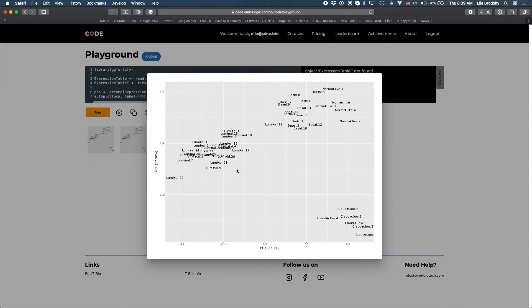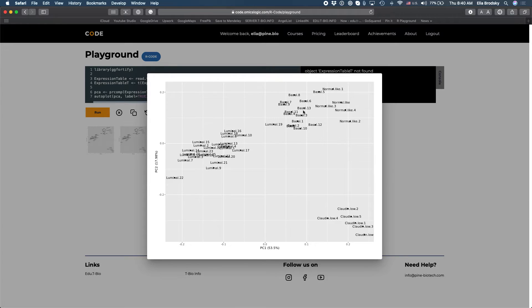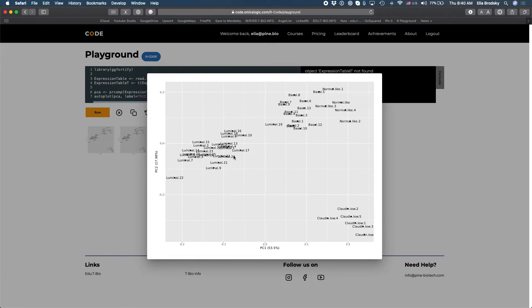Okay so here we have now labeling of samples and we can see basal, a group of basal samples, normal like, cloud and low, and luminal. So these are some labels that we will refer to when we compare the different groups.